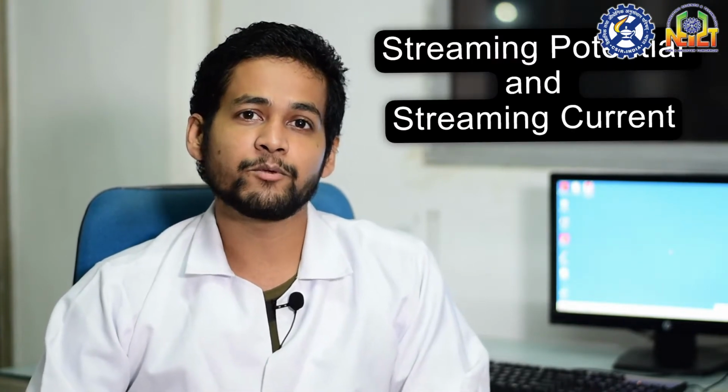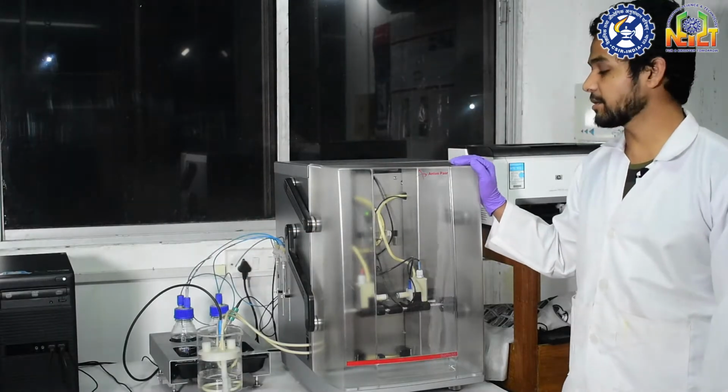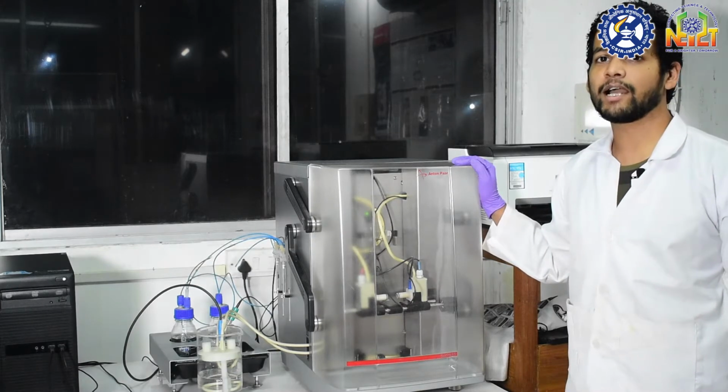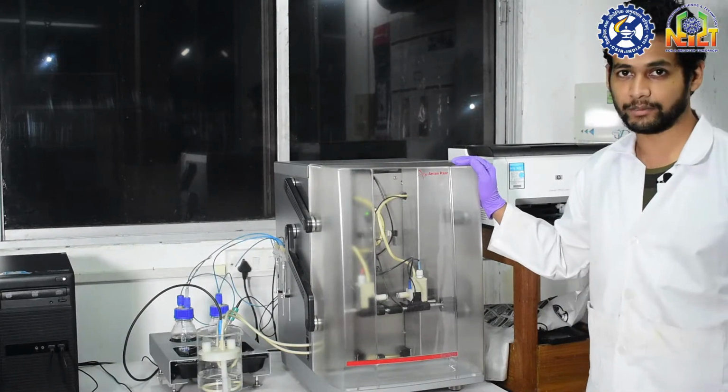A surface electrokinetic analyzer determines the zeta potential at the solid-liquid interface of macroscopic surfaces based on the measurement of streaming potential and streaming current, respectively. This is the surface electrokinetic analyzer that we have in our laboratory. Now I am going to demonstrate the operating procedures of this instrument.